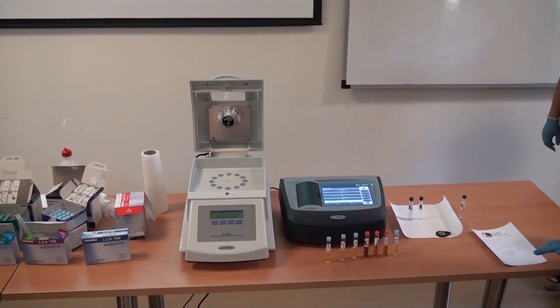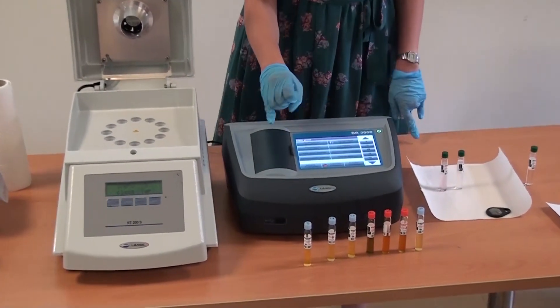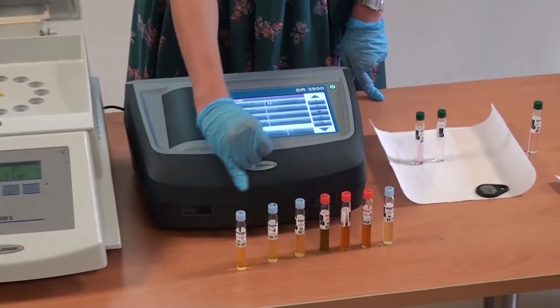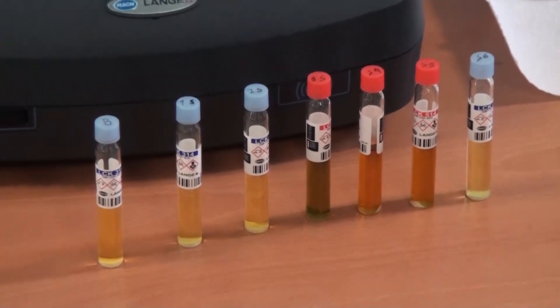Don't forget we have different ranges and concentrations. The lower range is with the blue cup and the red one is the higher concentrations.